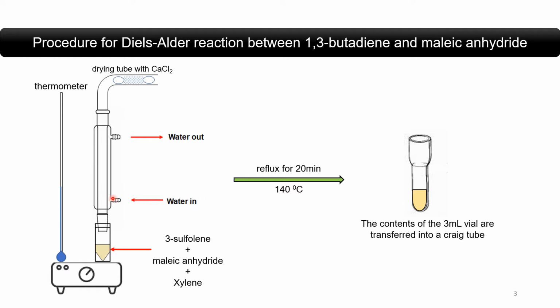Cold water comes in through the bottom outlet and absorbs any heat that is present here, and if there were any evaporated gas molecules around here, the heat will be absorbed and they will turn into condensates, droplets, and they will fall back to the reaction mixture.